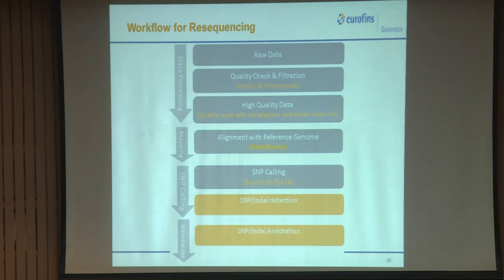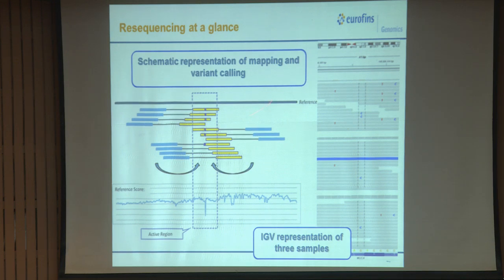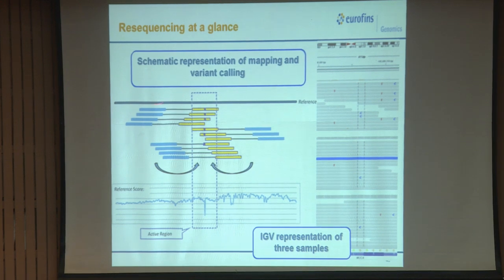Now, the next is your reference seq. We will just see how reference seq is done. We already have a genome sequence available. Once we have the genome sequence available, we just map the reads together. These are different reads with different sizes. In this, we do not require a hybrid assembly, nor do we require different libraries, because we already have an existing genome, right, and we map the reads.